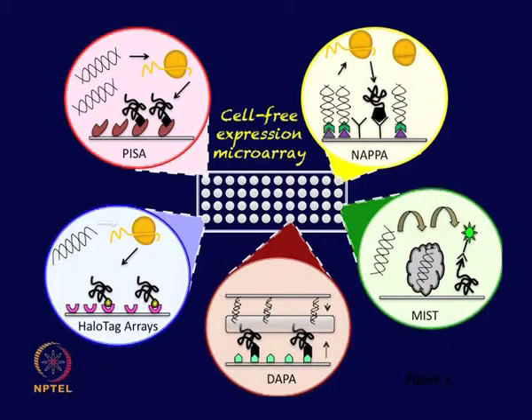The application of cell-free expression based protein microarrays has seen a rampant increase because of the ease of synthesizing the proteins using a cell-free expression based system, as compared to the traditional cell-based way of purifying the protein and then printing on the array surface.